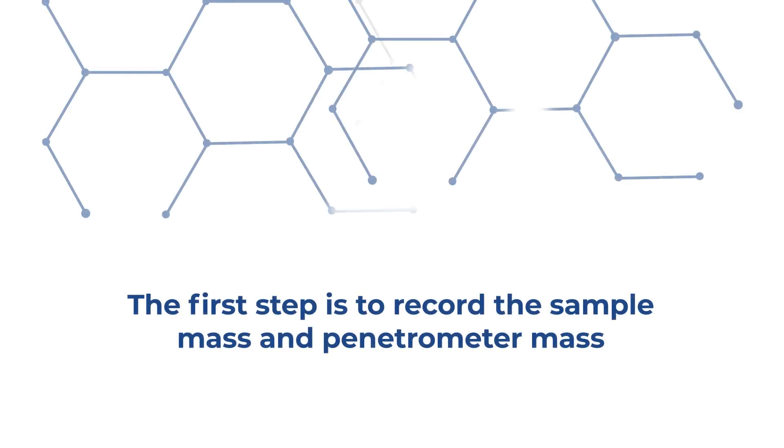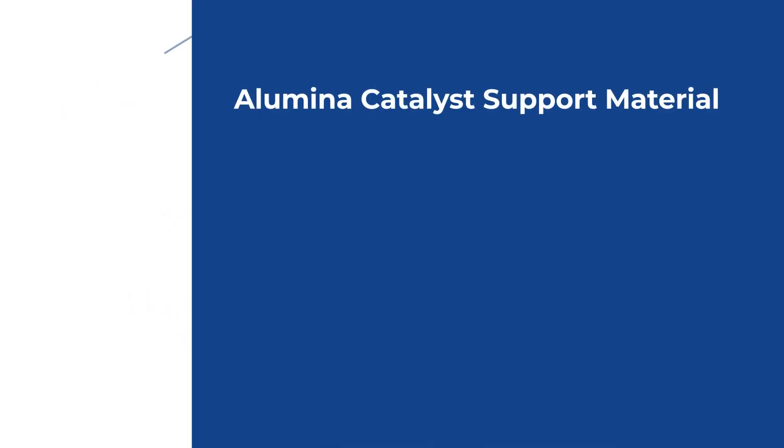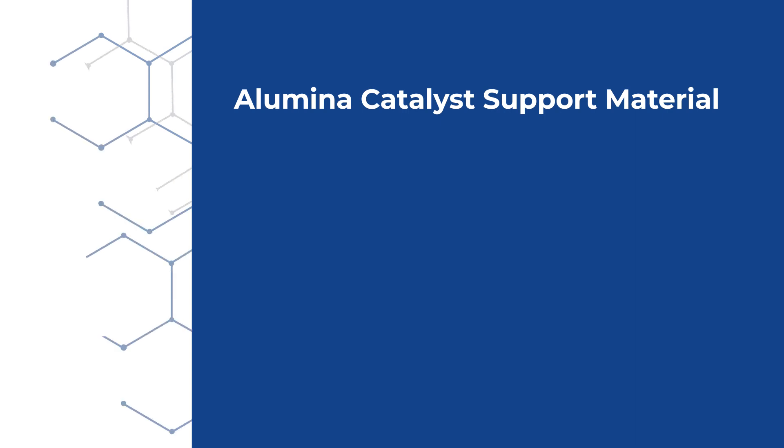First, Chris will demonstrate loading a sample into an empty penetrometer and then sealing the penetrometer for analysis using the Autopore. He will determine and record the sample mass as well as the penetrometer mass, both of which are needed for calculations of specific intrusion volume and material densities. Initially, Chris is going to determine the mass of the sample test portion. Today he is analyzing an alumina catalyst support.